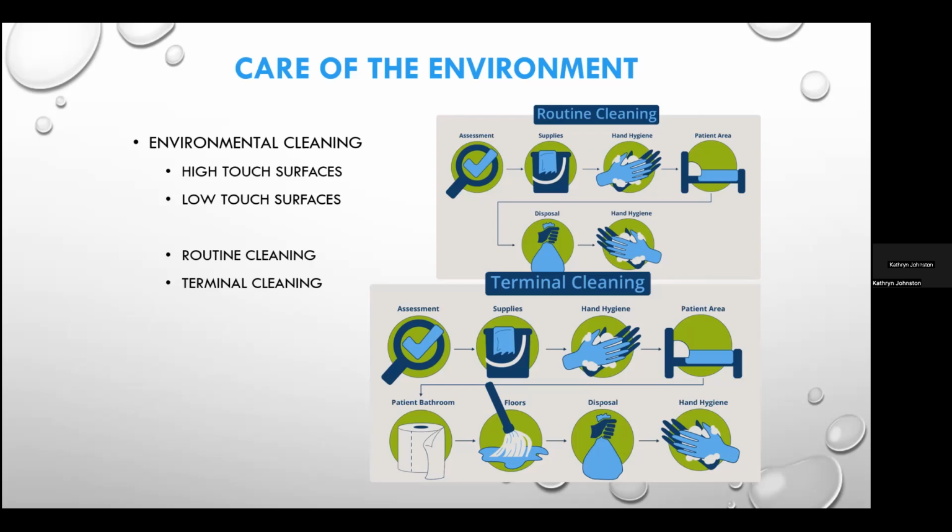So the laboratory work area should be cleaned daily, as I said, and more frequently in areas that are prone to heavy microbial contamination. That's part of a risk assessment that should be done by the laboratory supervisor or the laboratory director, and it should be incorporated into the cleaning process of the laboratories.